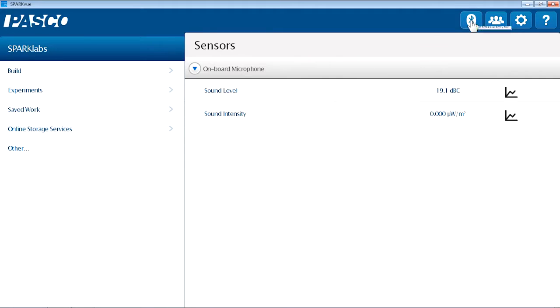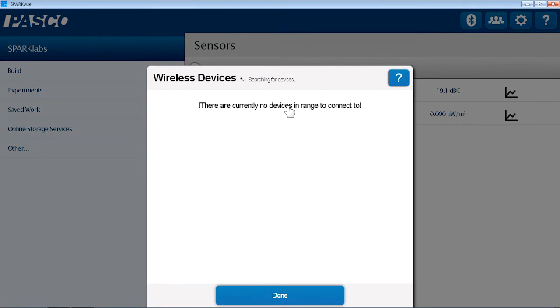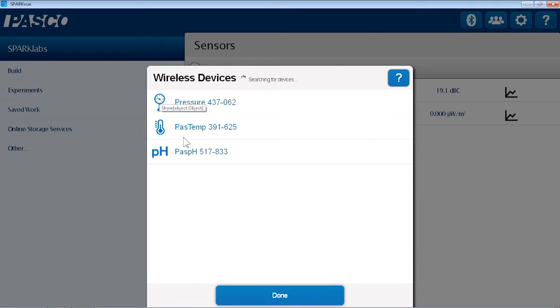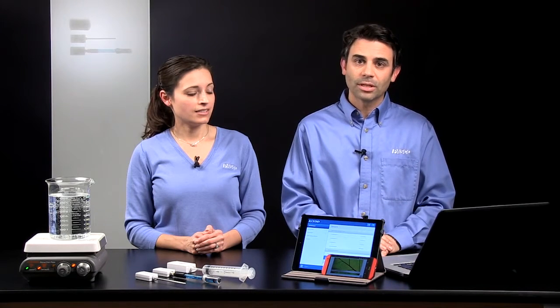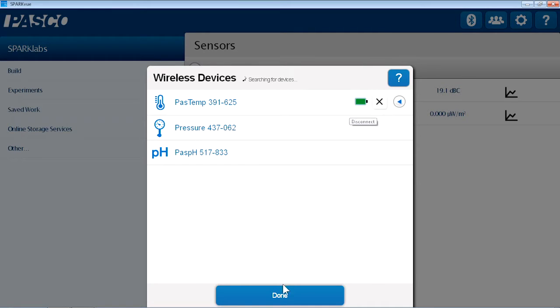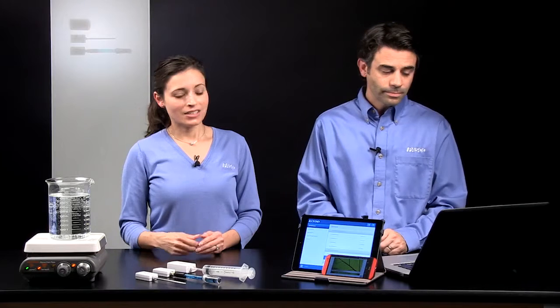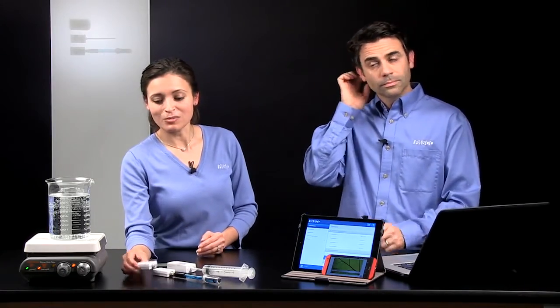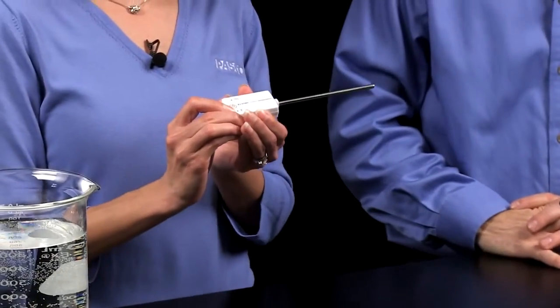So in my software, I can touch the Bluetooth icon. And I will see which devices are broadcasting that signal. And I can see based on measurement, through using these icons, that there's a pressure, a temperature, and a pH. And if I have a class set of a particular measurement, I can identify them based on their unique ID number. So I'm just going to touch the temperature sensor. It's going to connect to that sensor. I can see that it's connected. I'll hit Done. And I can see on the sensor that the Bluetooth light is now flashing green, indicating that it's connected.